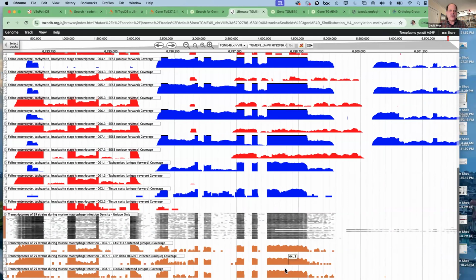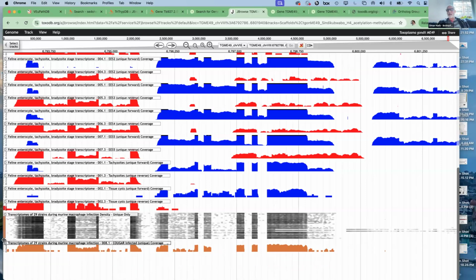And I just went in and turned on 3 of those, and they show up in orange, so they are not strand specific. I have no way of determining whether these 2 genes are on the same strand or on opposite strands. And the second question was whether you can display the RNA-seq data against other, I'm assuming you meant, strains from the same species.